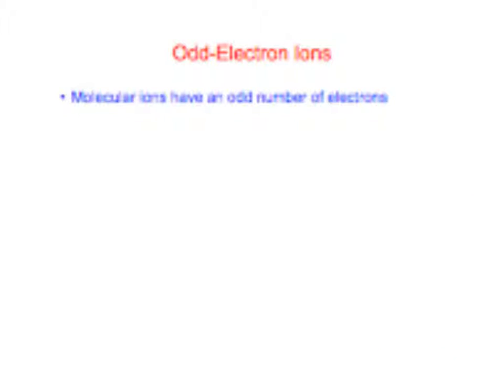All right, so we generate these ions, okay, and how are they generated? So, some examples. If we have something like an ether, it has two pairs of non-bonding electrons.